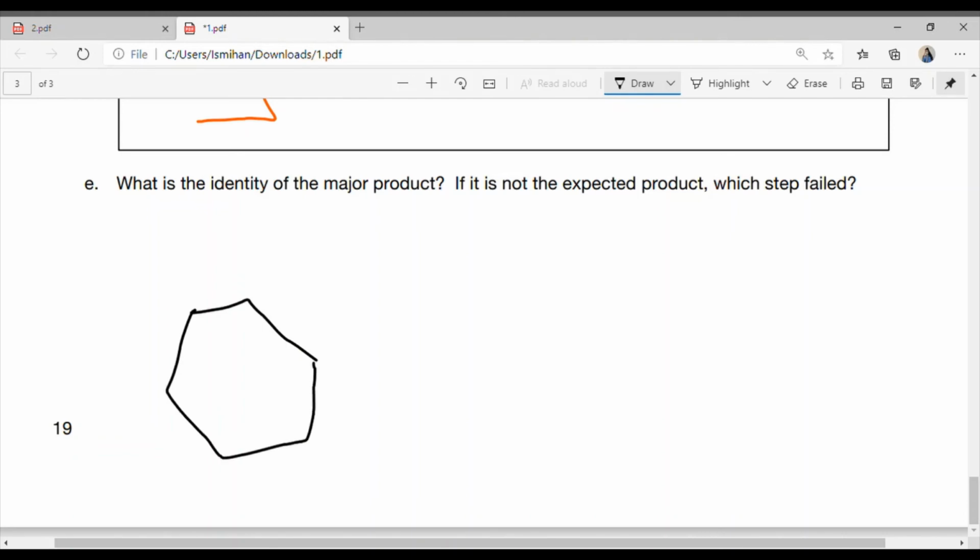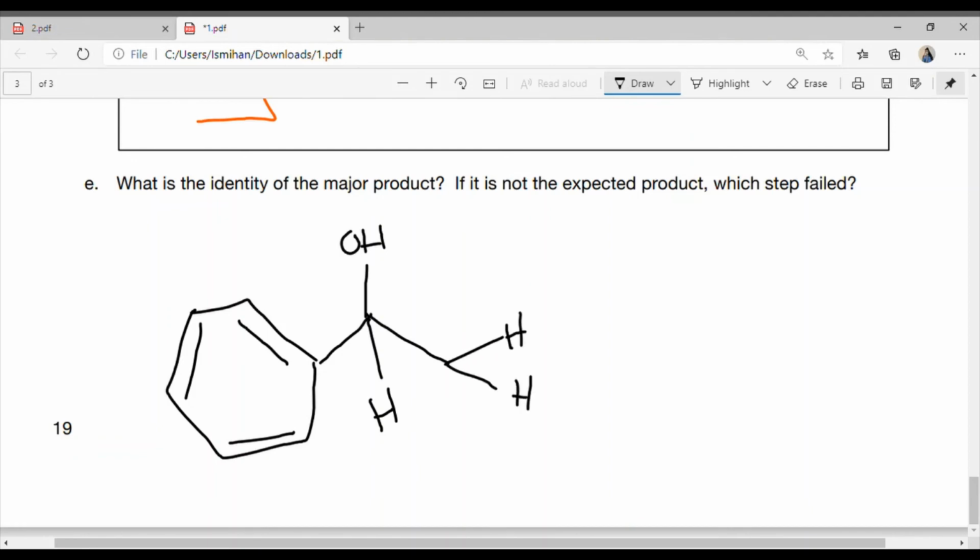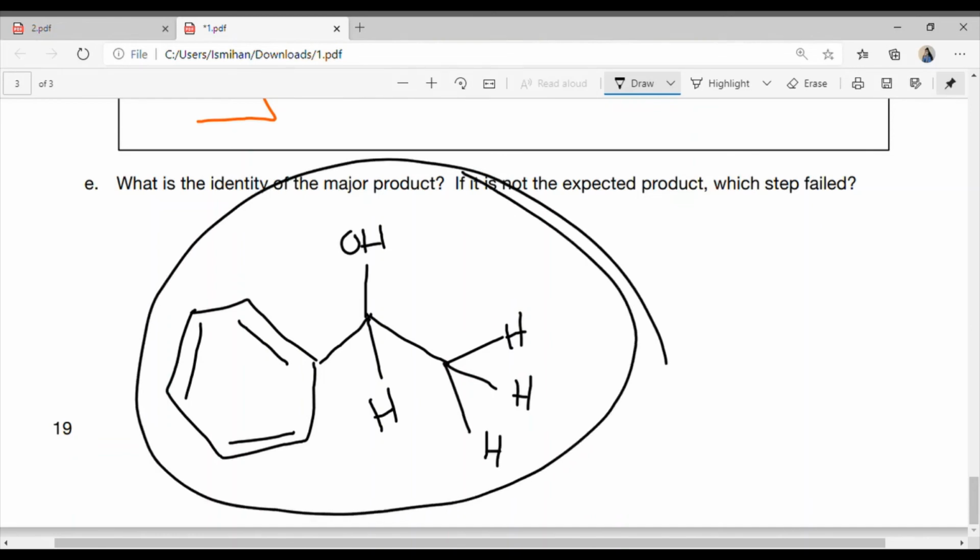Okay, and I know that that arene is on an edge of a molecule because there were 5 hydrogens that were all the same signal. So there were no differences, meaning they were all equal in terms of what was happening where. Then we knew that this was connected to some sort of hydroxyl group, so I'm going to put that here, and that there was a hydrogen here, because remember that one 4.8 signal hydrogen that we had? And then we also had that methyl group here. And this is our finished molecule. This is what we've determined from the infrared, 1H, and 13C NMR.